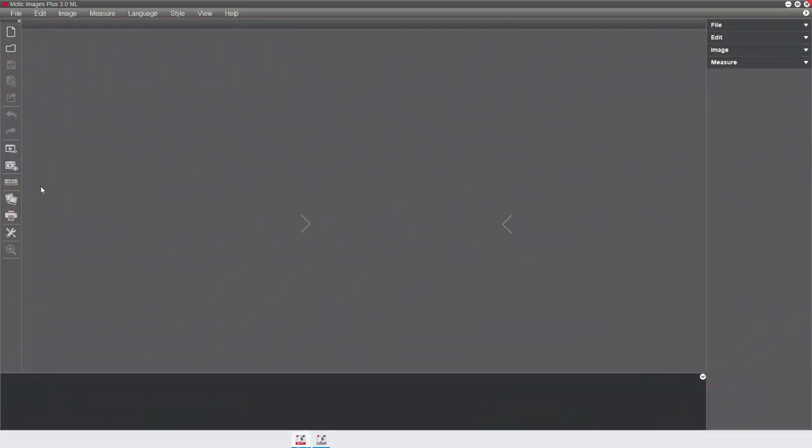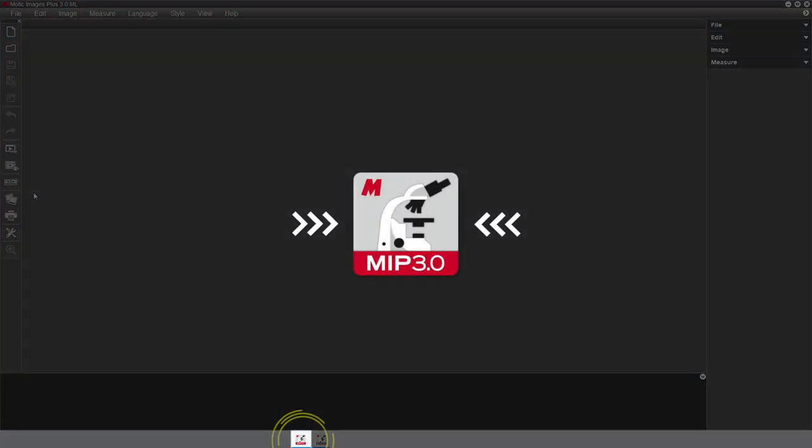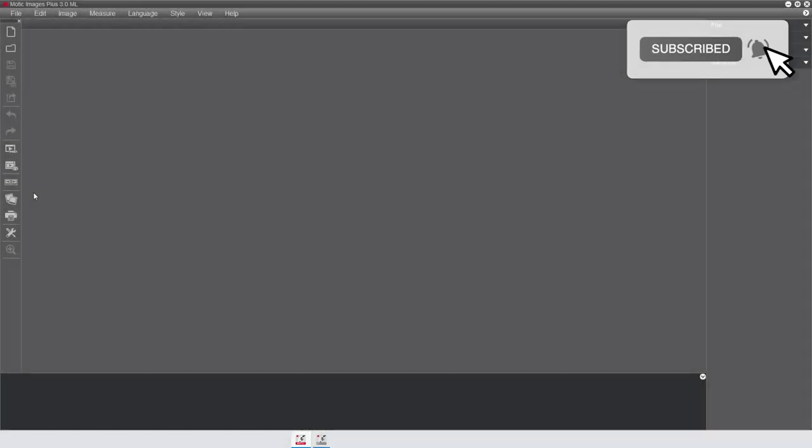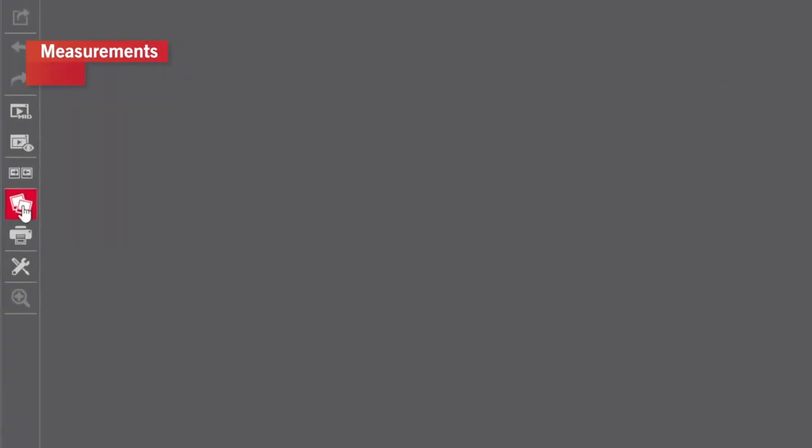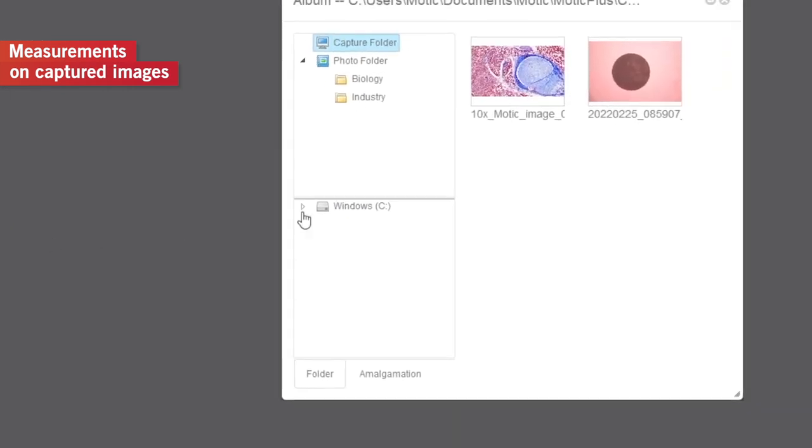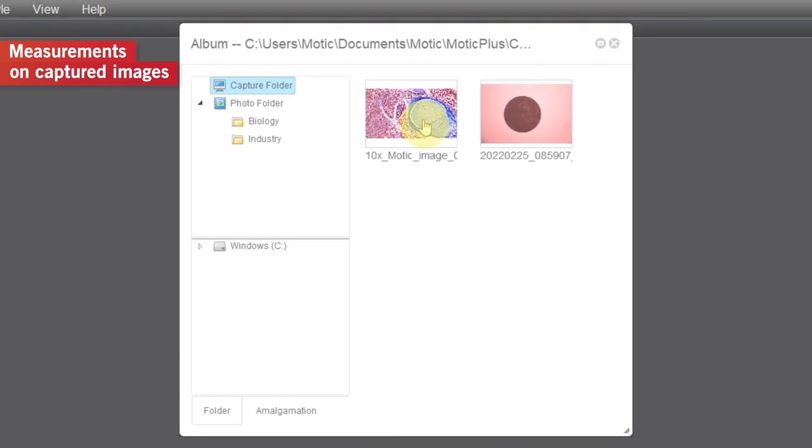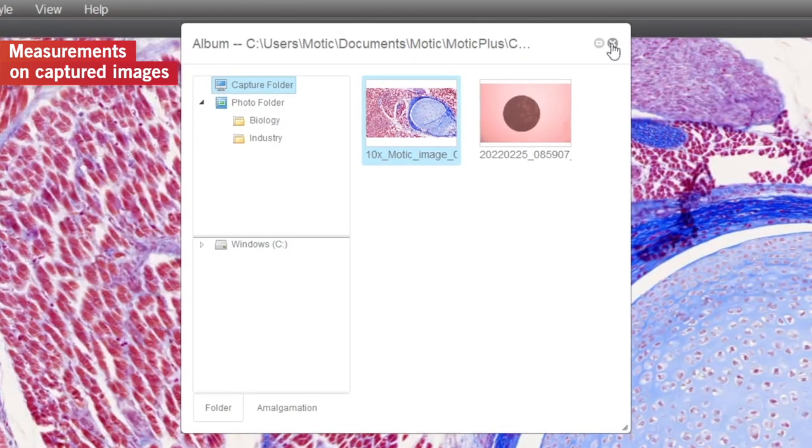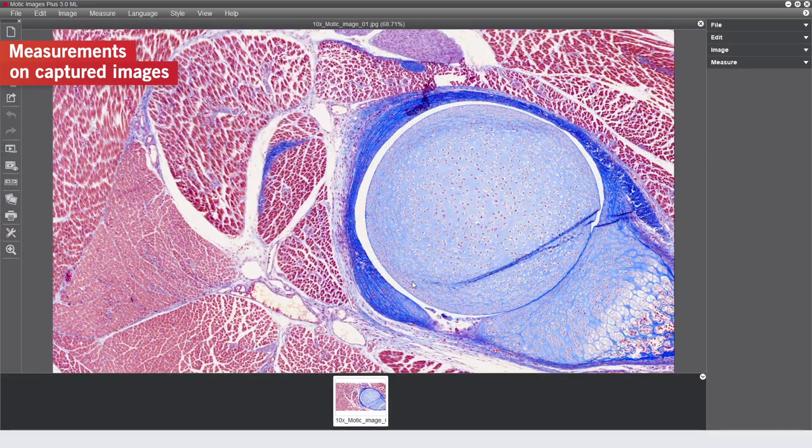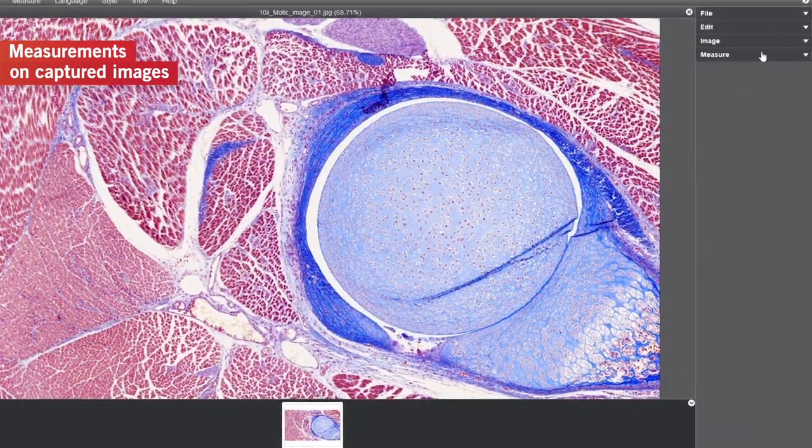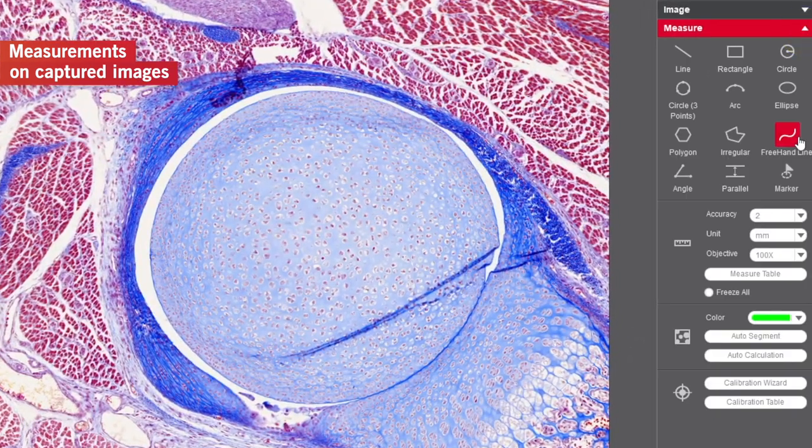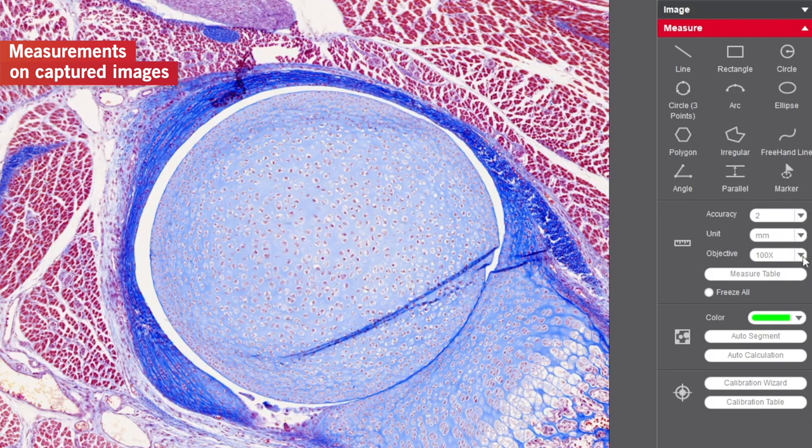Here, we need to work on the Motic Image Plus 3.0ML module. Open an image captured with a determined objective you have calibrated. Go to the measure panel on the right of the screen and select the corresponding objective on the drop-down objective menu.